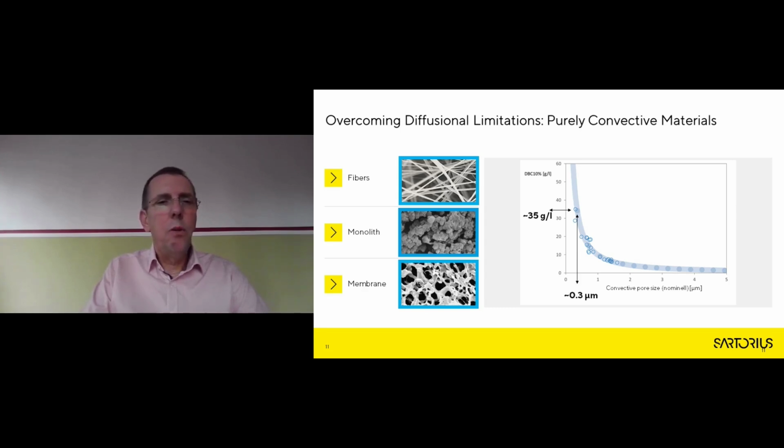The resulting low permeability will lead to elevated pressure drops, requiring low bed heights in order to enable short residence times, making it difficult to design a scalable device family. Furthermore, small convective pores introduce a high fouling propensity, making it difficult to achieve reproducible and robust processing over many cycles.